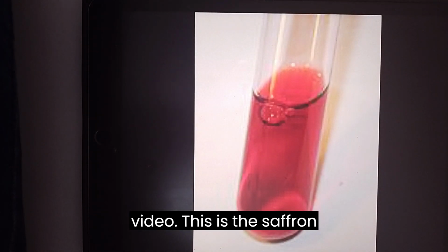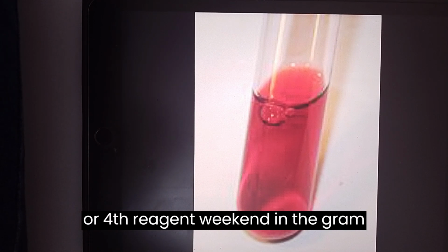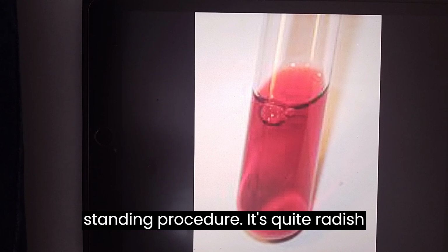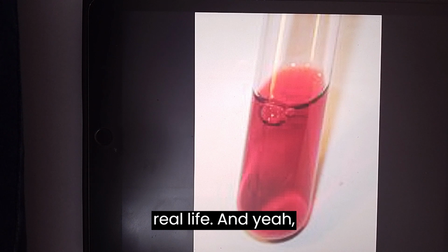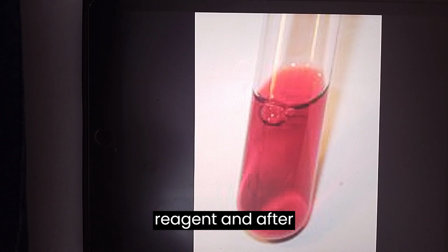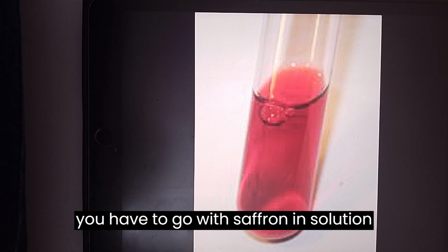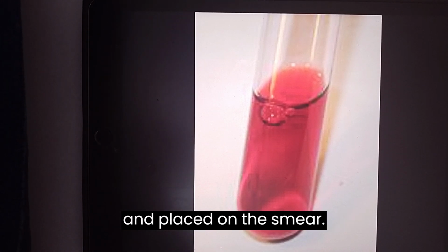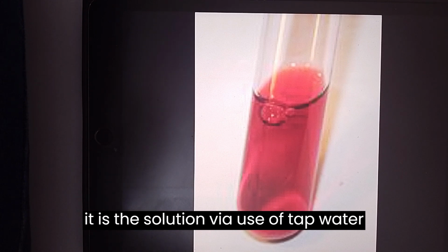This is the safranin stain. It is the fourth solution, or fourth reagent, used in the Gram staining procedure. It's reddish orange in color in real life, and it is used as the fourth reagent. After using acetone and tap water, you go with the safranin solution and place it on the smear. Keep it for 30 seconds, then wash the solution off with tap water near the sink.